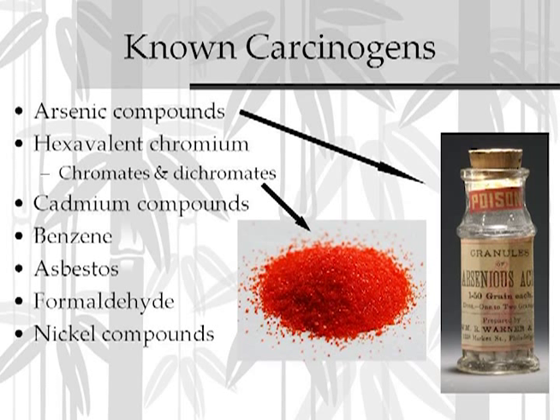All of the dichromates and chromates are powerful oxidizers, and in contact with any organic material, there's a great risk of them bursting into flames. So now you have something on fire that's also generating carcinogenic smoke, not something we recommend.